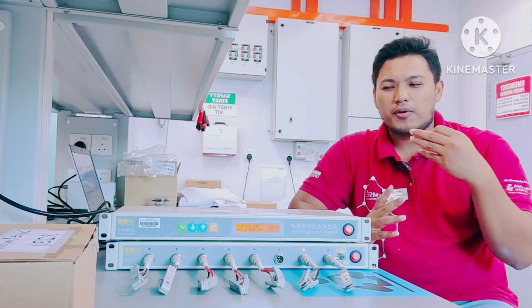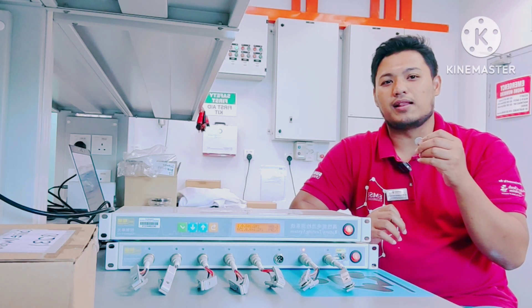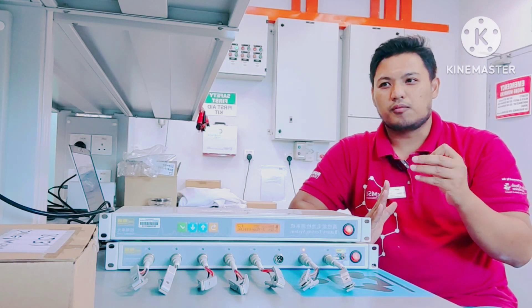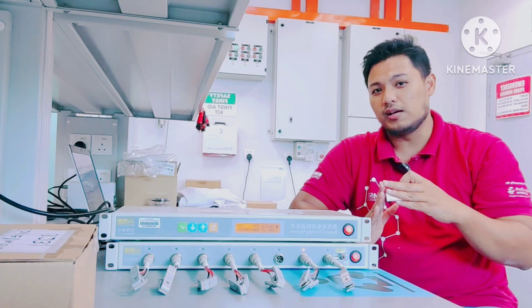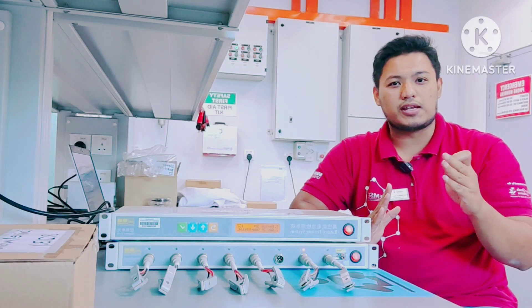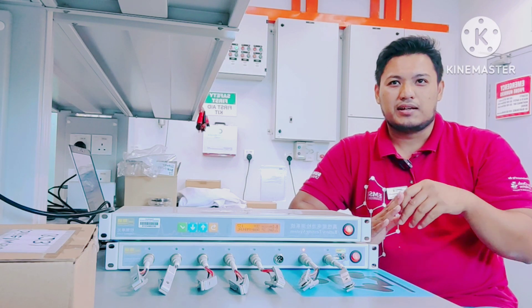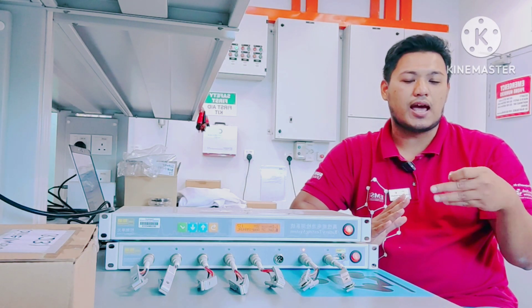What I'm going to highlight here is that you can actually prepare this coin cell at a lab scale. The elements of a coin cell include the anode, the cathode, the electrolyte, and also other components.